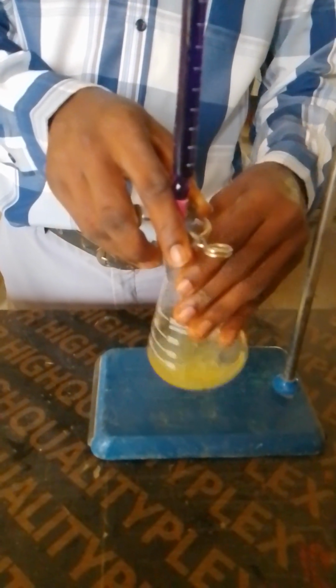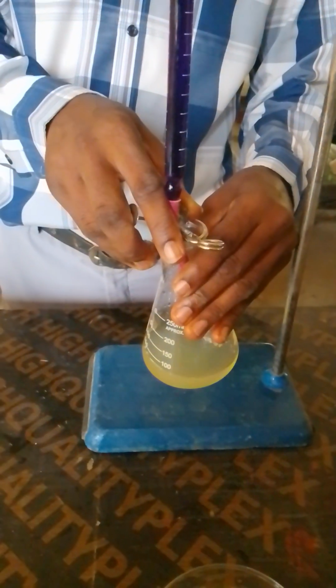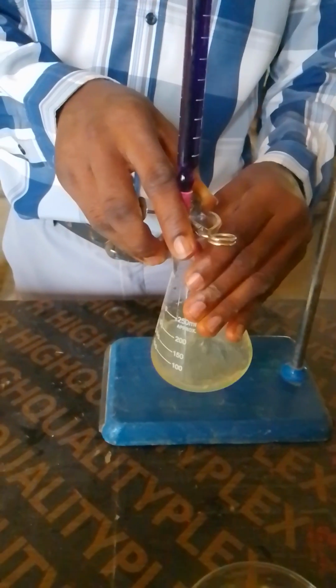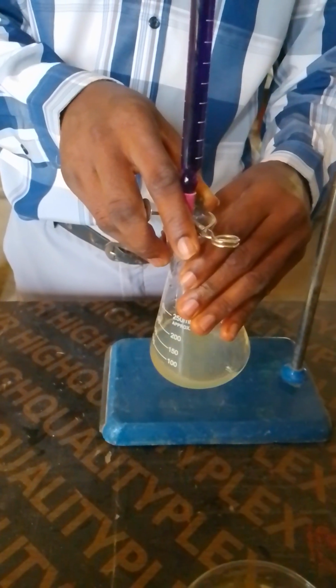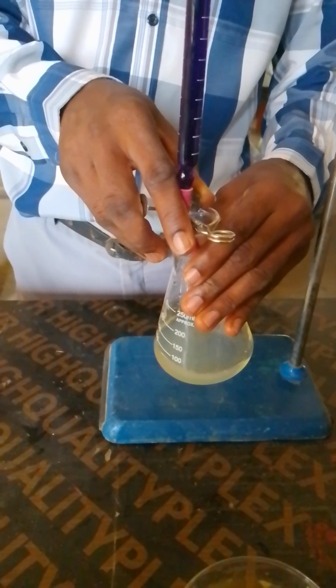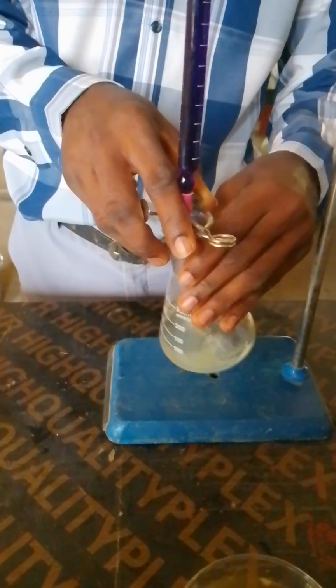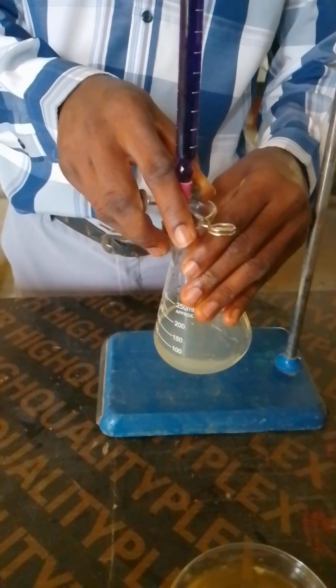When you are doing your rough, just try to be very careful so that your rough will be very close to being correct, because you need to save time, so that the next one you do will just be the other one. Then you just add plus or minus 0.2 to obtain your concordant readings, and you put your table. Mind you, do not do any cancellation in your table, because cancellation will attract -2 marks, or it can even be -4 depending on the level of the cancellation. You need to be very careful.